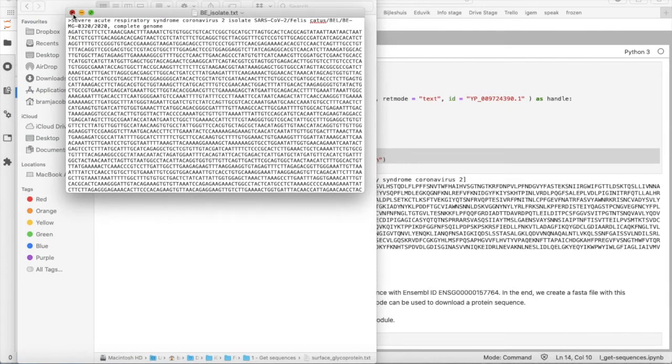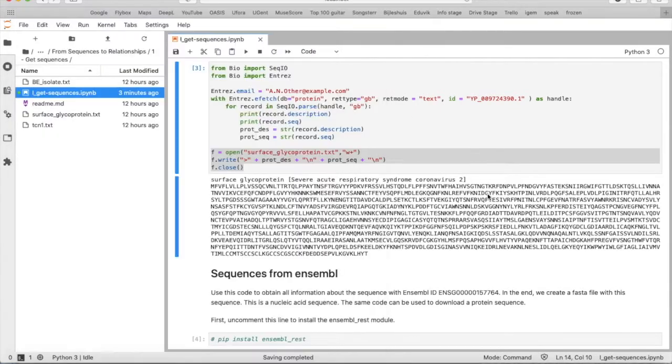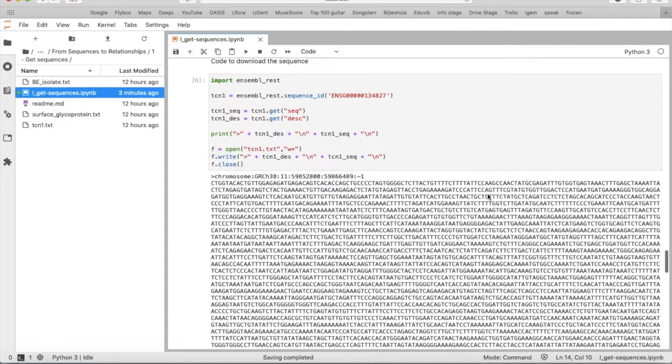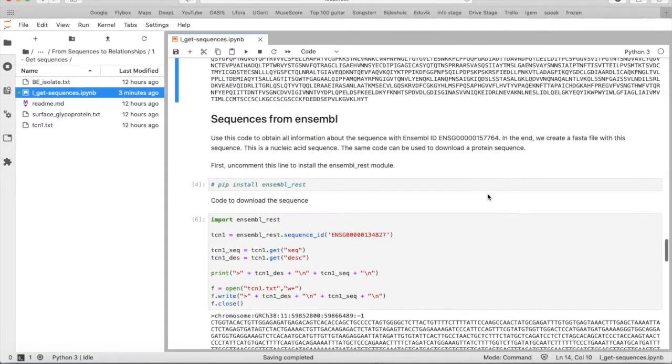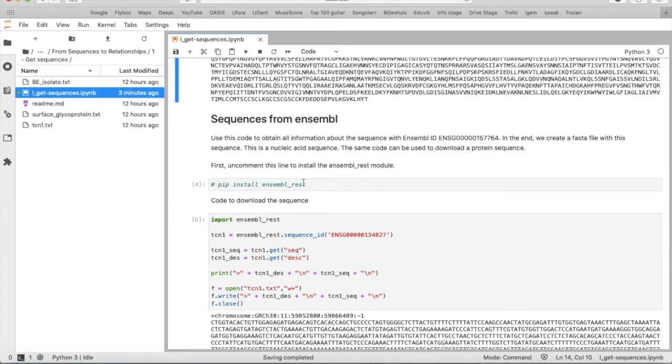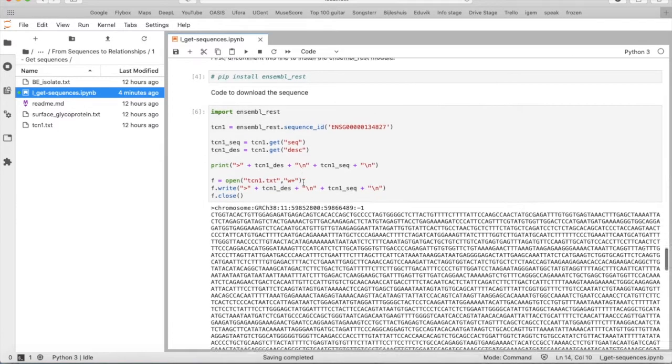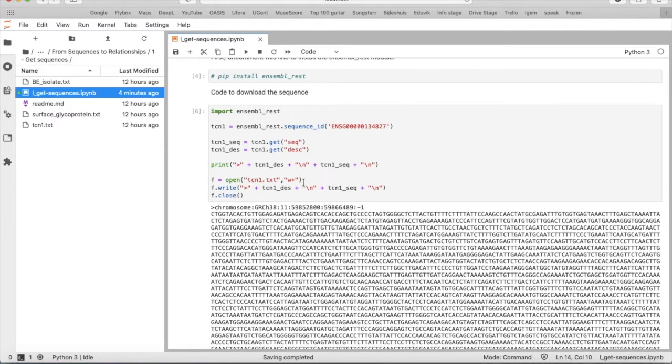Okay and then to finish you can also retrieve sequences from Ensembl, but then we need the Ensembl rest package because BioPython cannot do this. This code is a slightly different one, so first of all you import the package and then you say okay I will call my sequence TCN1, that's a gene that we search for.